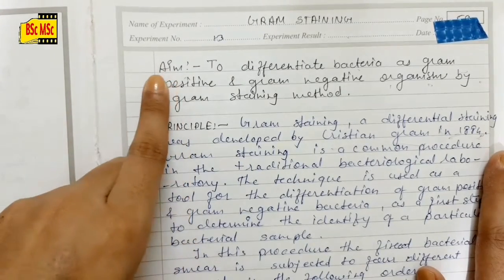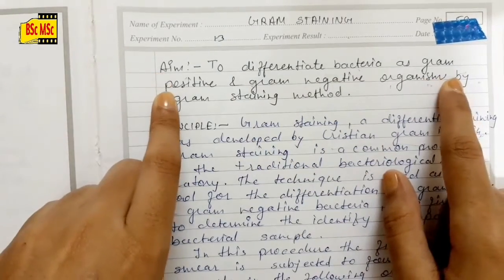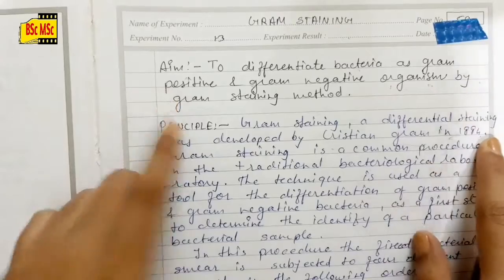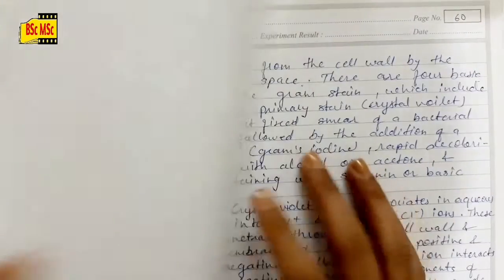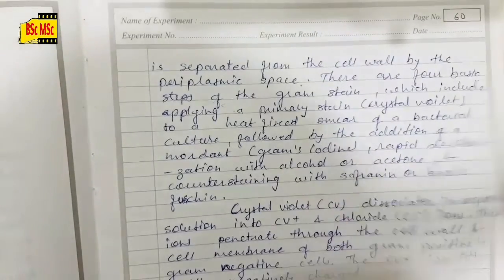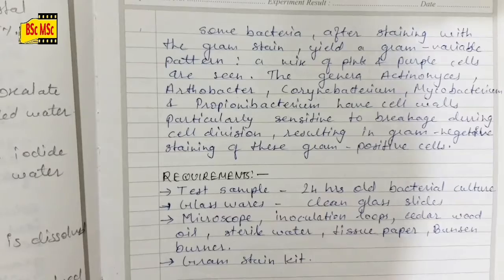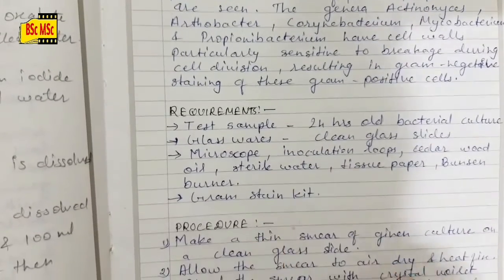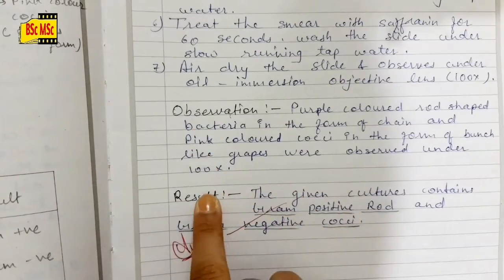First I have written the aim, that is to differentiate bacteria as gram positive and gram negative organisms by the gram staining method. Then the principle of the gram staining method, then requirements, whatever you will require, then the procedure, step by step, point wise, then observation and results.